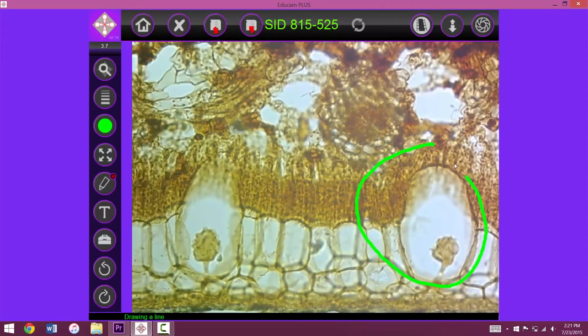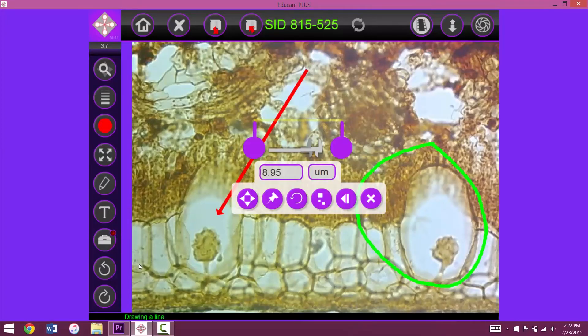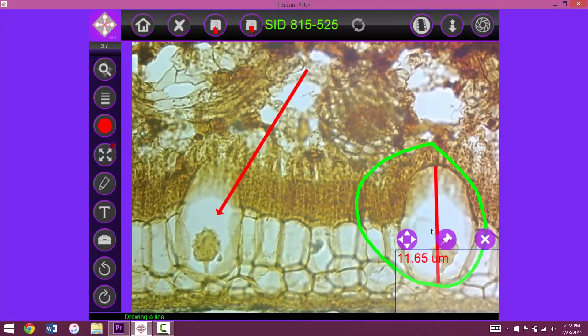Now that we've identified this cell, we can further investigate by measuring it. Finally, save your progress.